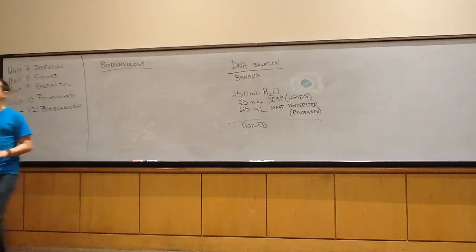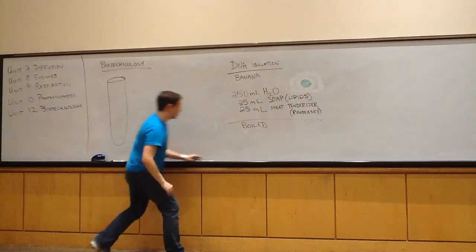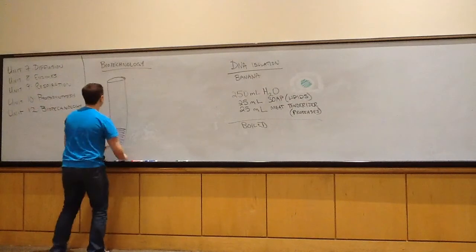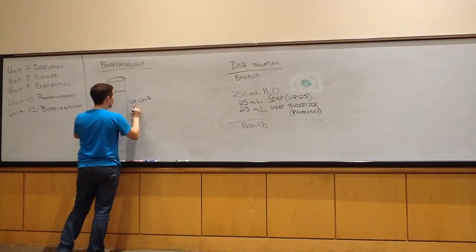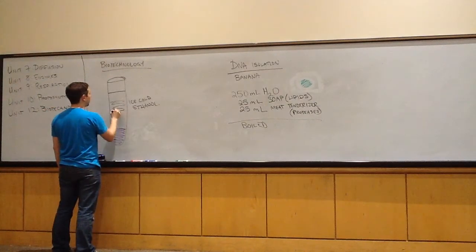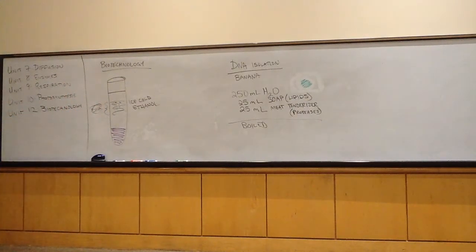So the very last thing that we did in this exercise was we took that mixture and we dumped it into a test tube, and then we had to add a solution that DNA is insoluble in. And that solution is ice-cold ethanol. Once you add that ice-cold ethanol, you should see this white kind of stringy stuff that has bubbles in it. And that represents our DNA. That is our DNA.